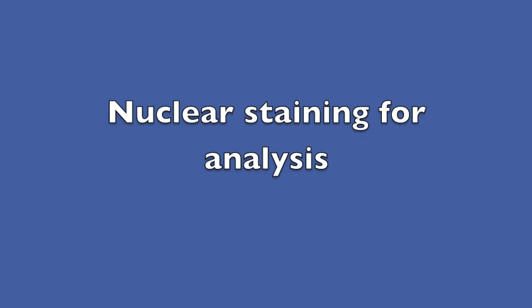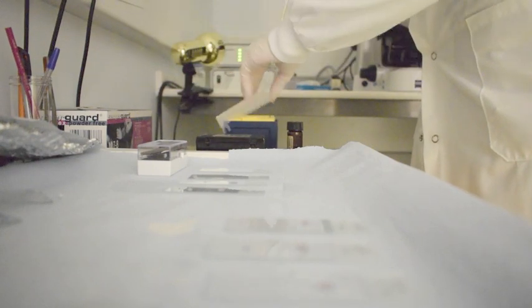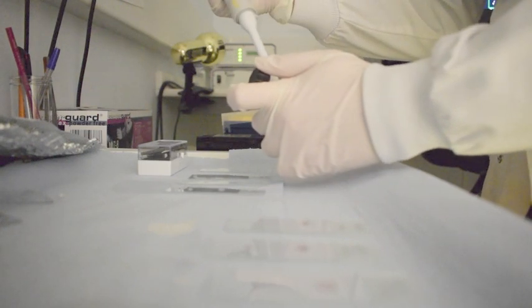Nuclear staining for micronucleus analysis. Slides are laid flat. These slides have previously had cell suspension pipetted onto them and have been left to dry.